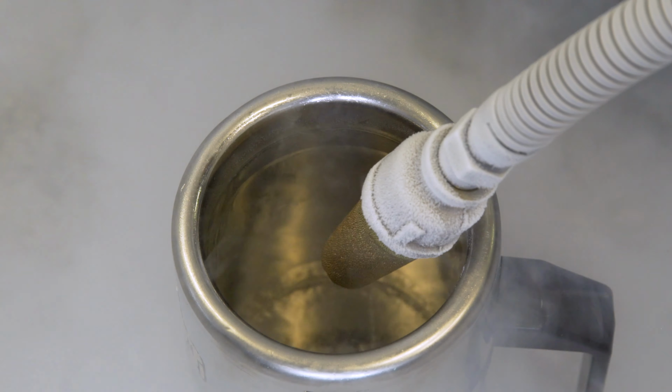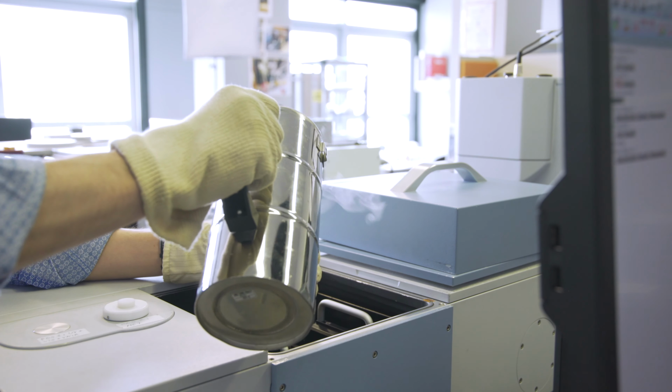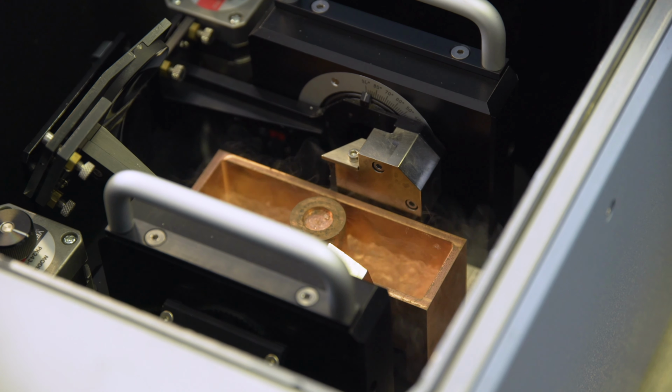We measure ice samples by cooling down with liquid nitrogen because we are interested in studying asteroids and comets. We are involved in the Rosetta mission, in the Hayabusa 2 mission, in the Dawn mission to Ceres and Vesta, so to asteroids and comets. And so we want to measure samples, but just putting them in the same environment as they are on those bodies.